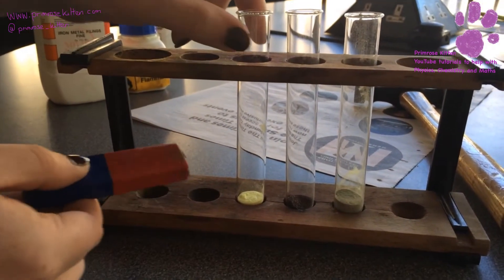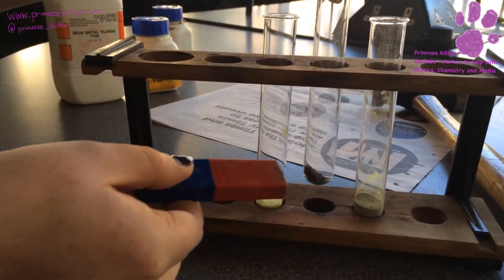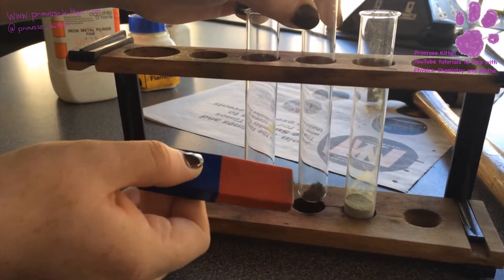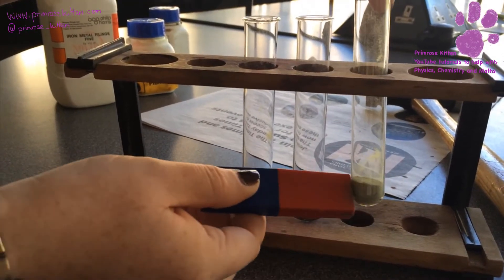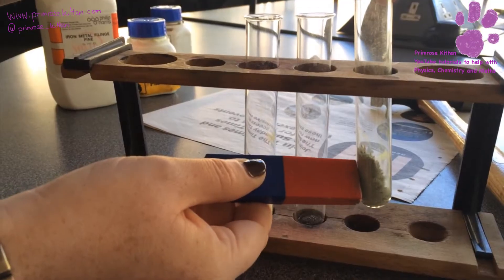Here is a magnet. So if we just test the sulfur, we can see nothing happens. If we test the iron, we can see that that is lovely and magnetic. And if we test the mixture, we can see that the iron filings in there are dragging up the sulfur.